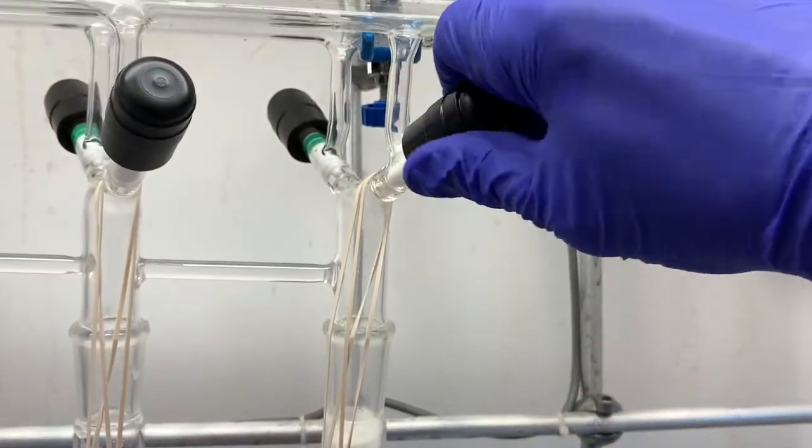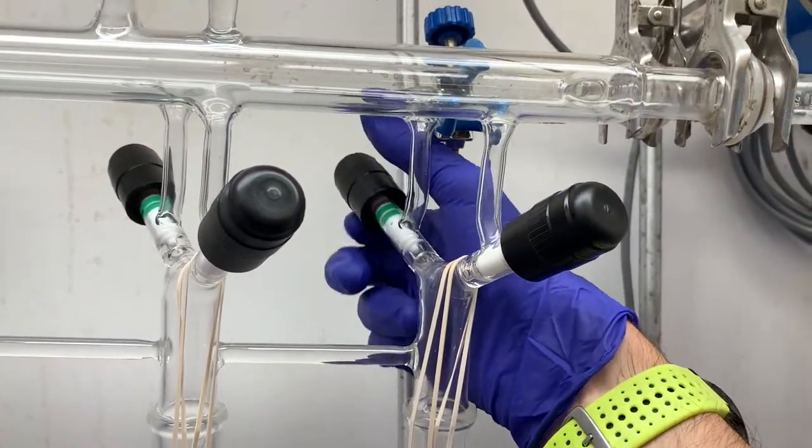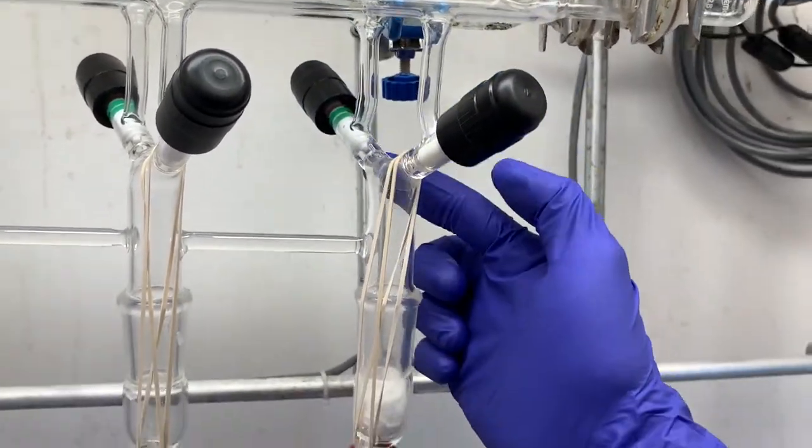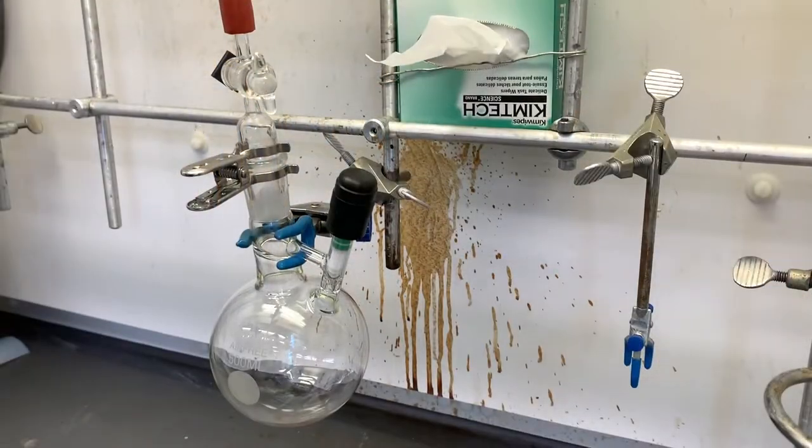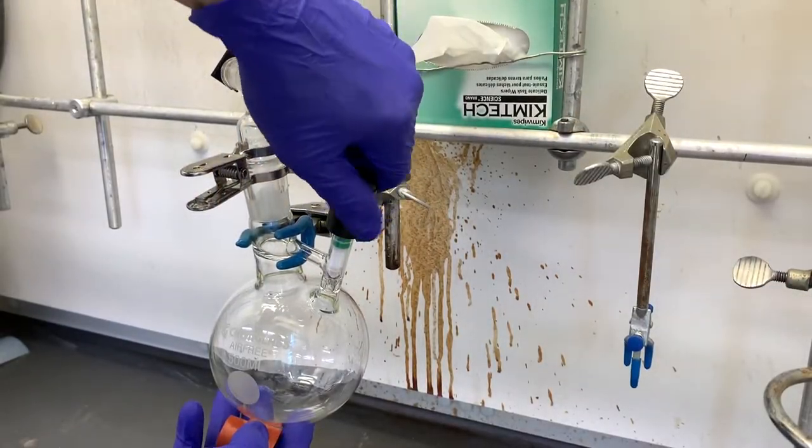Once your flask is at room temperature, close the vacuum port and refill the flask with nitrogen. Perform two more of these evacuate and refill cycles before ending on the refill and having the flask under nitrogen pressure.